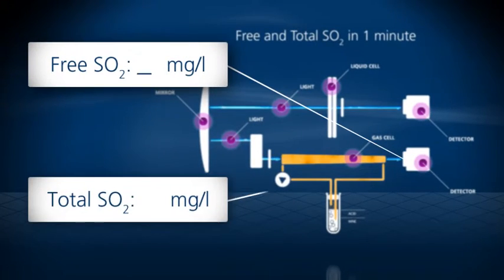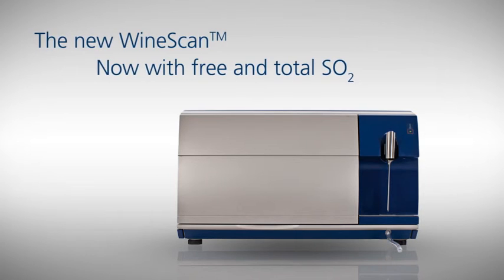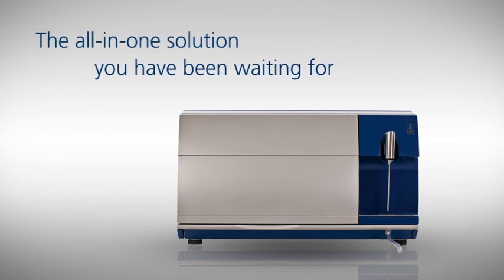Free and total SO2 results are generated parallel to traditional liquid WineScan parameters, and results are delivered in just over one minute. The new WineScan now with free and total SO2—the all-in-one solution you have been waiting for.